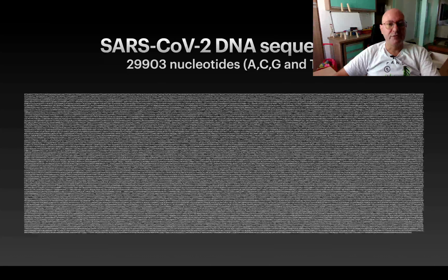30,000 nucleotides. So, for example, the position of the spike protein, which is the one we are focusing on, and why? Because the vaccines are made on top of this one. You take the genome substring from these positions and then compare the variant to the original Wuhan virus. If you count all these yellow genes, you will count 11.